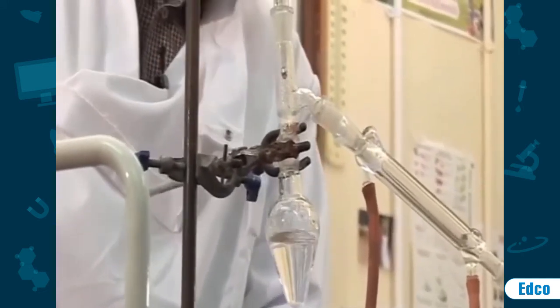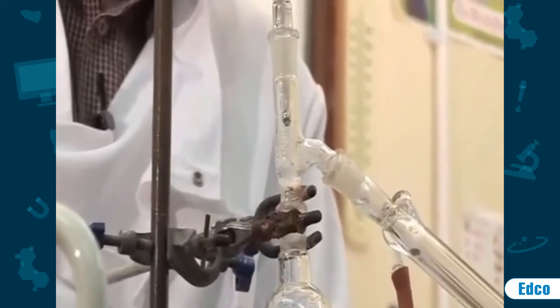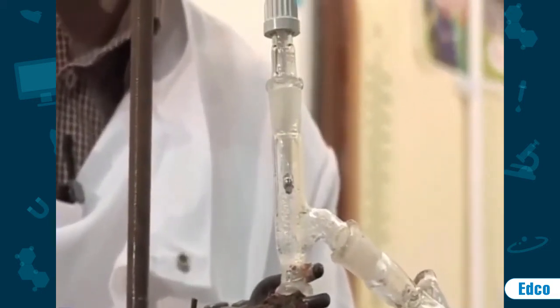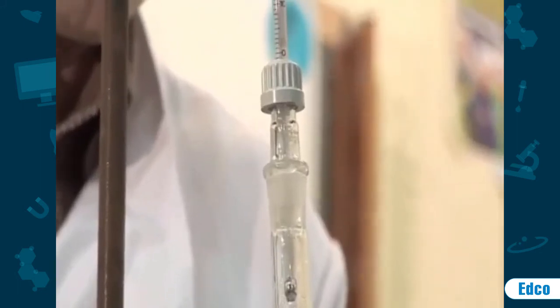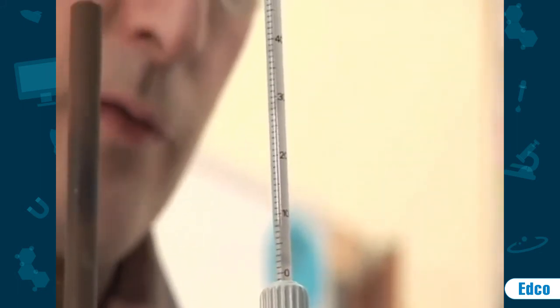I have put in some anti-bumping granules to ensure that the solution boils smoothly. As you can see, the alcohol is beginning to boil, so I will remove the heat.